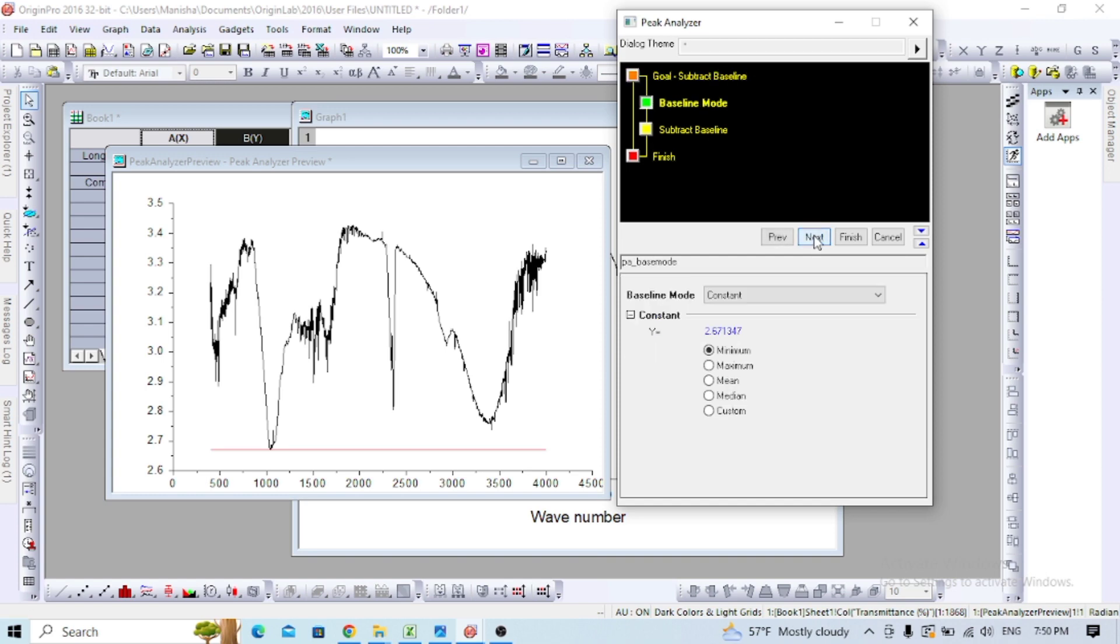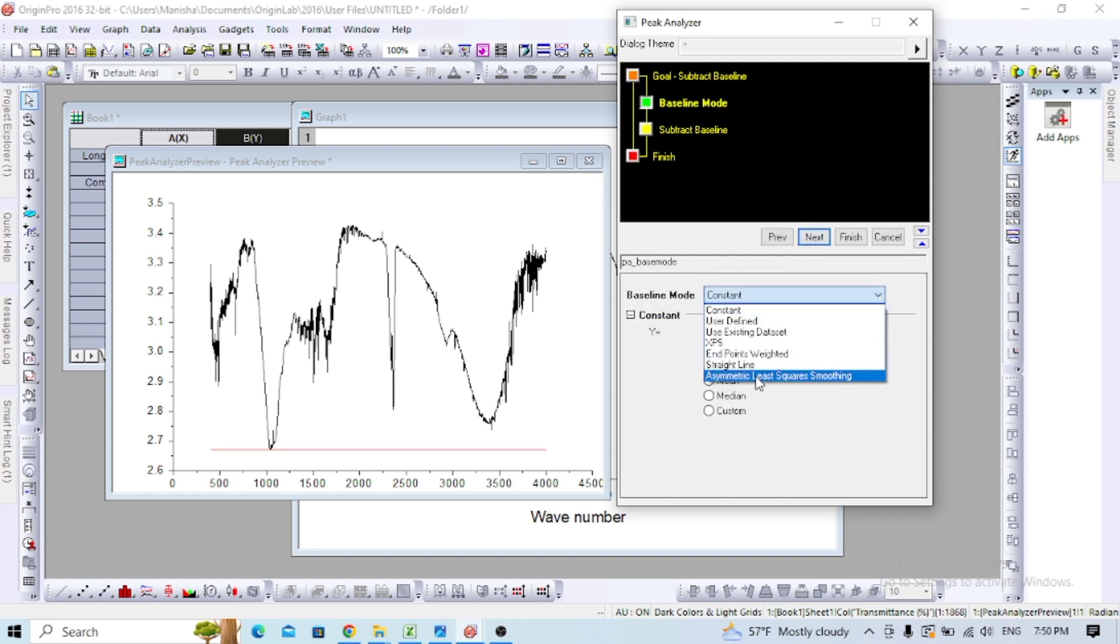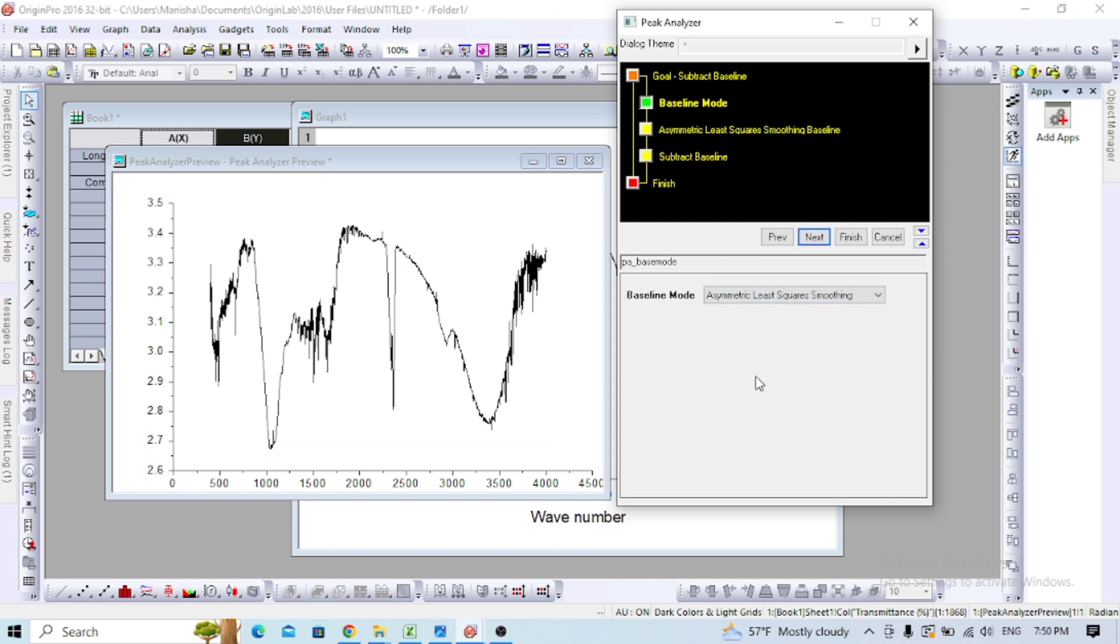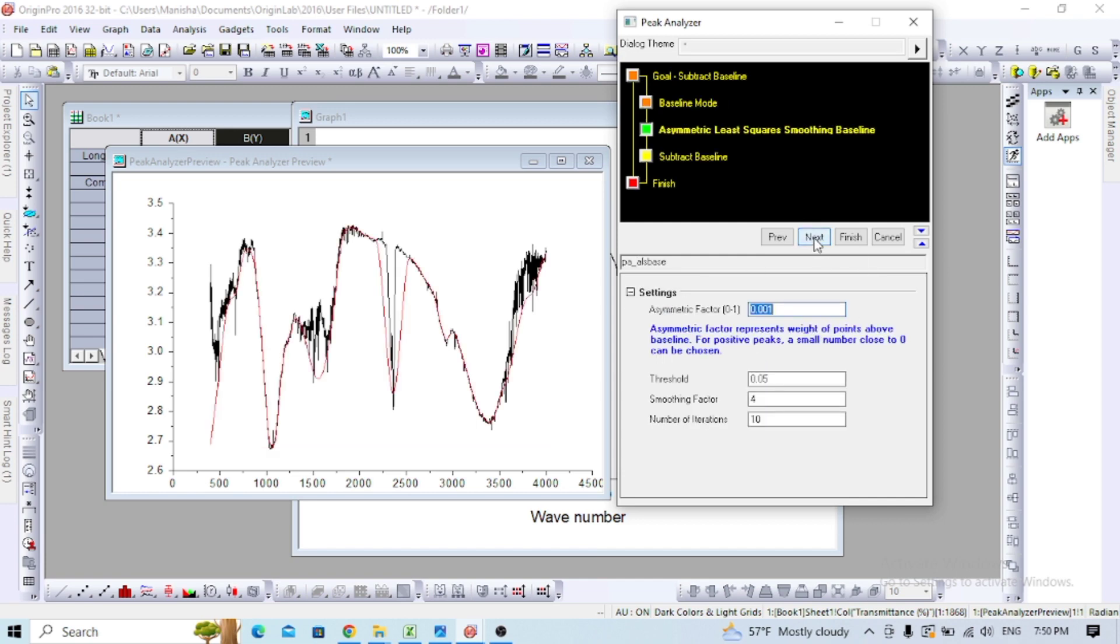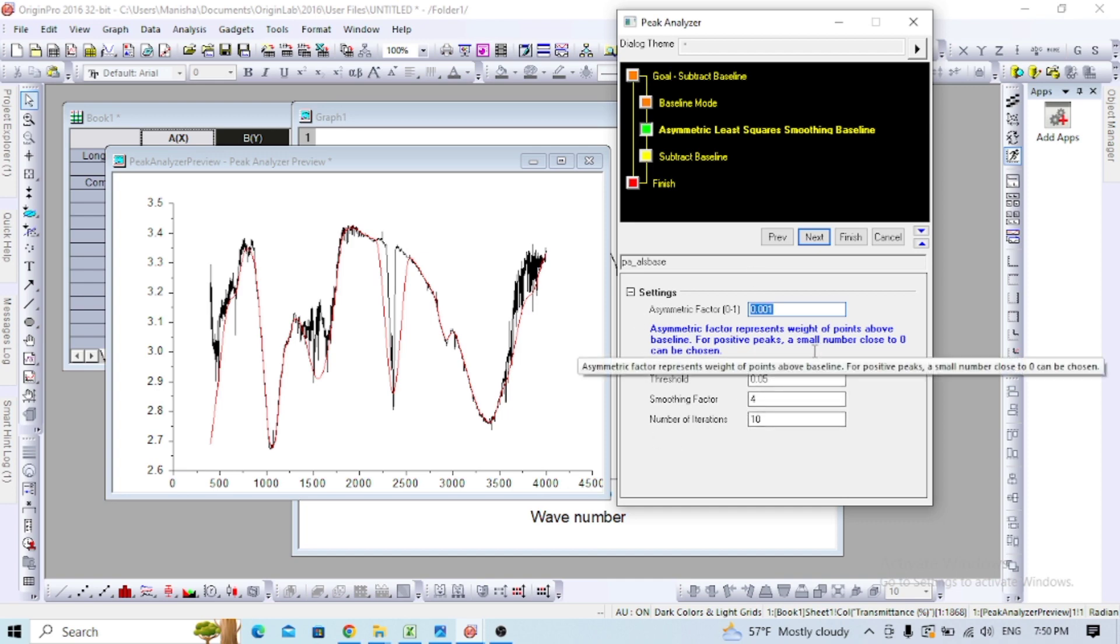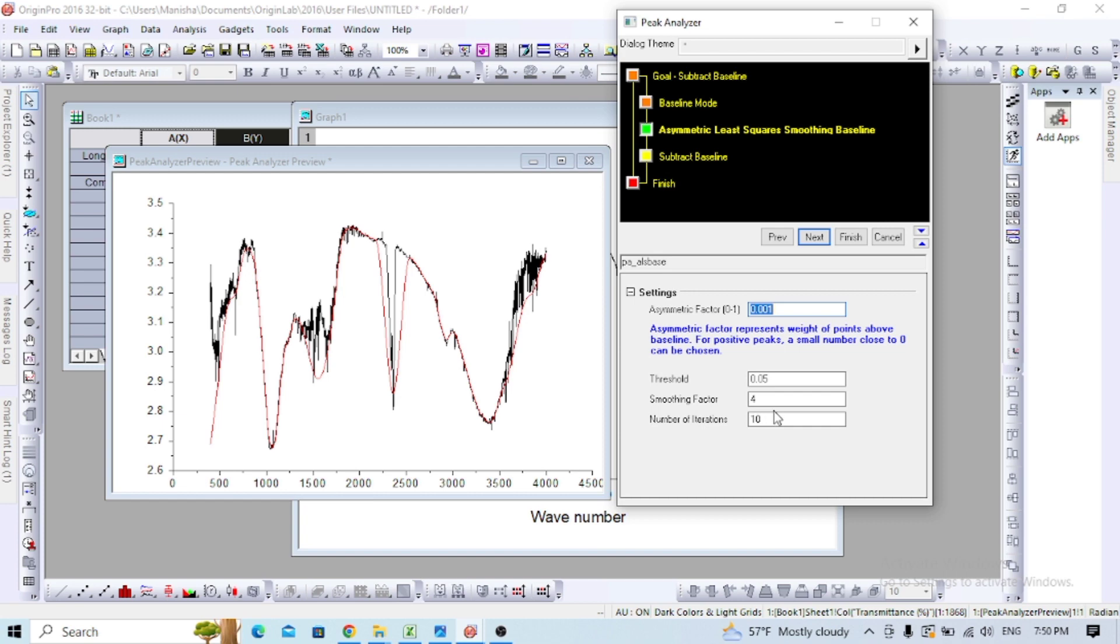In the baseline mode, select asymmetrical least squares smoothing and proceed to next. You can adjust the threshold smoothing factor and number of iterations, or keep it as is.